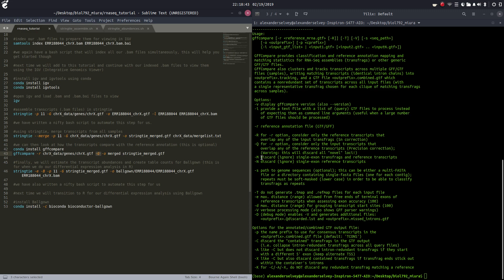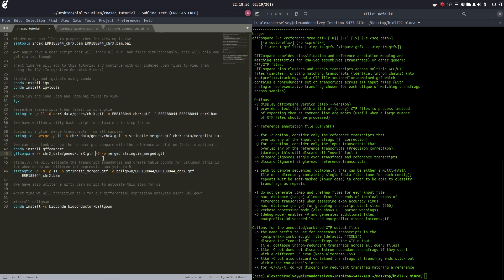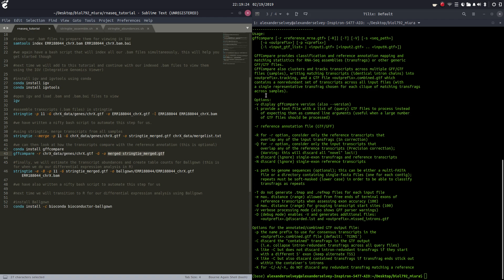Dash-G doesn't seem to have an entry in the manual here. I assume dash-G is much similar to the guide GFF flag we've seen before, meaning this is our guide GFF or guide GTF file. Dash-o I'm assuming is our output prefix.